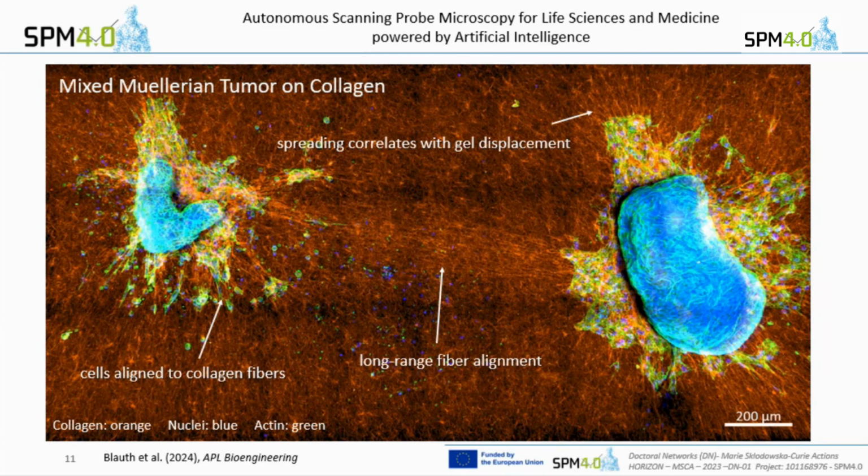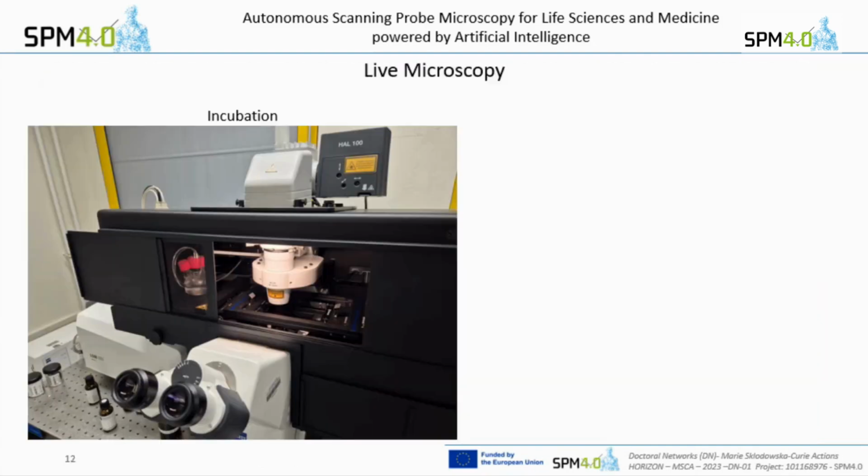You can naturally also do it live, with living cells and tissue, and there it gets a little bit more complicated. People who have worked with cell culture know that you have to keep cells under certain conditions so that they stay alive and grow. Usually it's 37 degrees for human cells; people who work with fish cells, I think, are at 25 or something. They also need a certain amount of CO2.